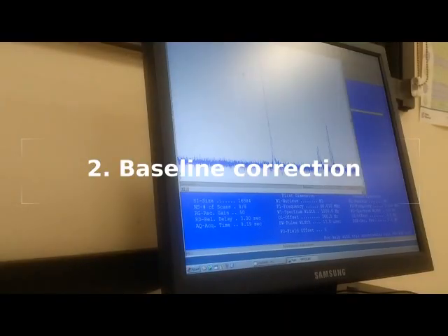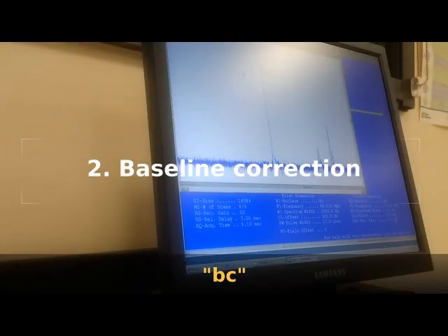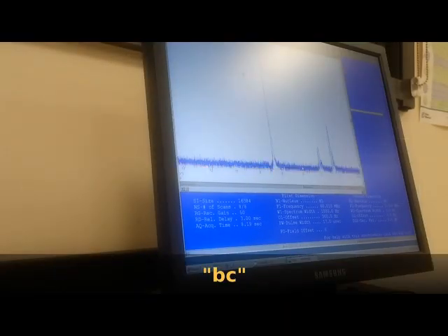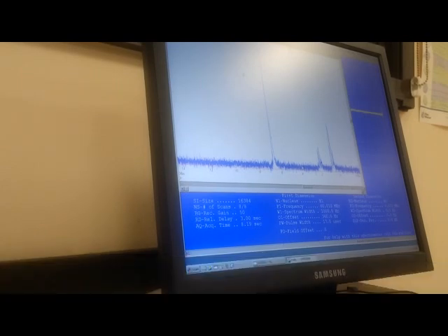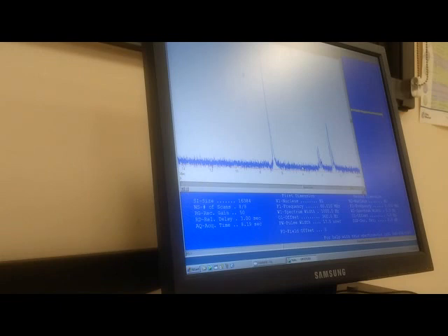Once you adjust the phasing, you will want to type BC. And that's all we have to do. That does the baseline correction so that everything is flat at the bottom. This will help with your integration. Without baseline correction, your integration curves will look really awful.